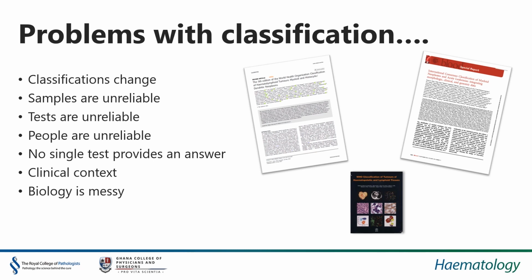Tests can be unreliable. Pre-analytical and analytical variables can significantly impact the diagnostic outcome. And many specialized tests still require some element of manual preparation, and human error can always impact the testing and analysis. So we can confidently say that no single test will ever provide an answer, and everything must be reported in the clinical context of the patient.